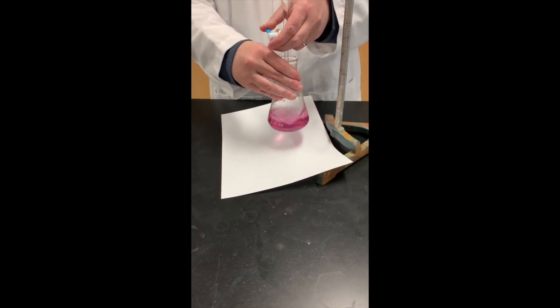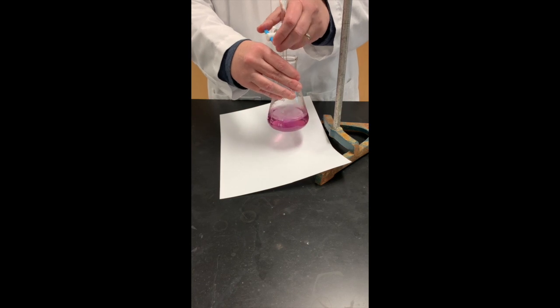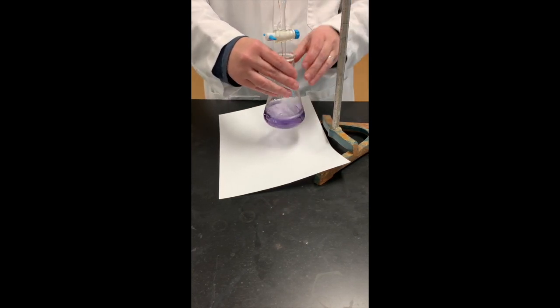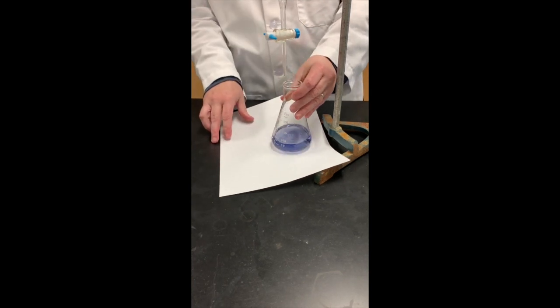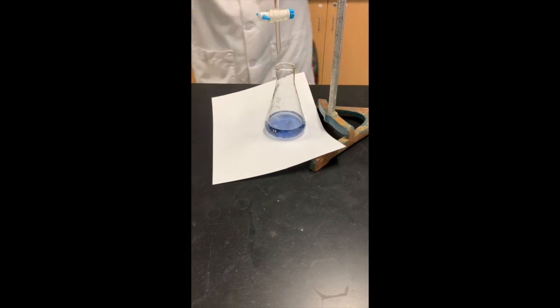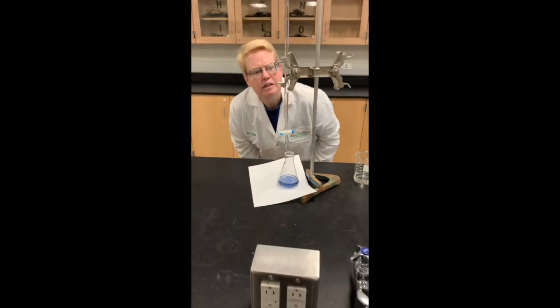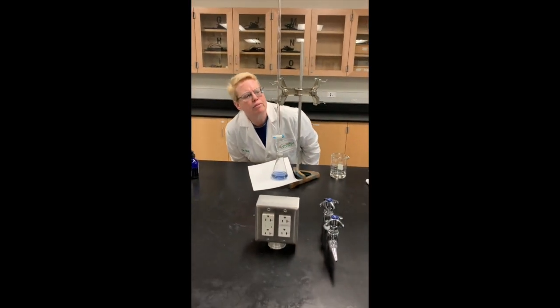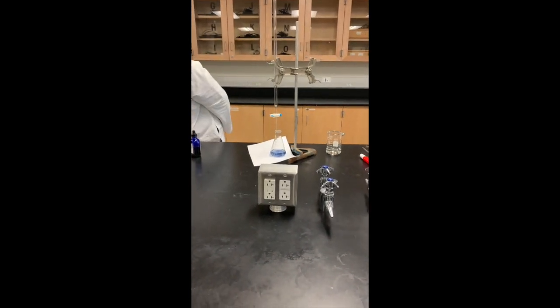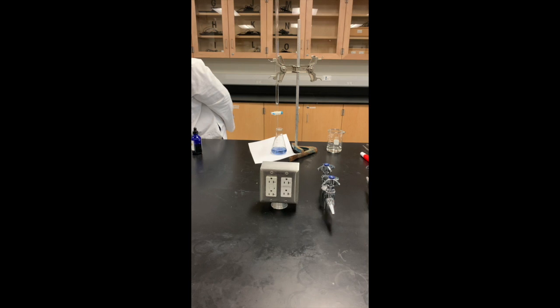Okay, now notice it's starting to turn a little bit blue, so I'm slowing down, and I'll add just a little bit more. And there we have kind of a purple, but when you look at the piece of paper, it does look blue. And so there you have it. There's the end of the titration. And when we read the burette, we see that it is at 43.90. So 43.90 is our final volume for that titration.